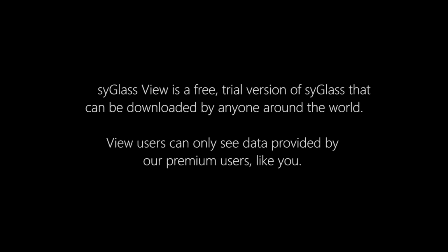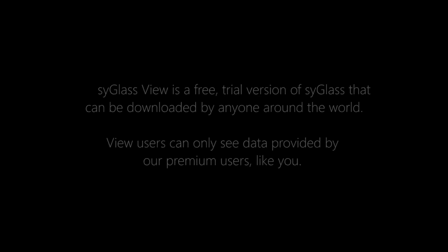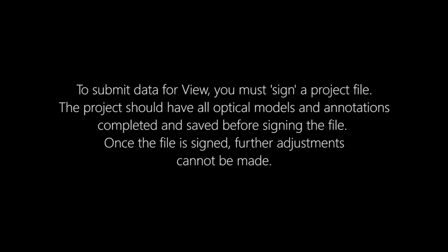syGlass View is a free trial version of syGlass that can be downloaded by anyone around the world. View users can only see data provided by our premium users like you. To submit data for View, you must sign a project file. The project should have all optical models and annotations completed and saved before signing the file. Once the file is signed, further adjustments cannot be made.